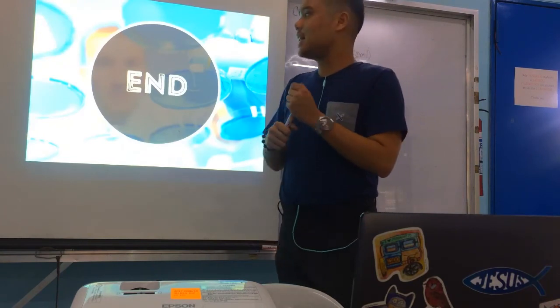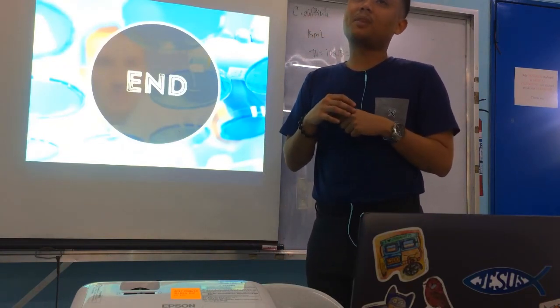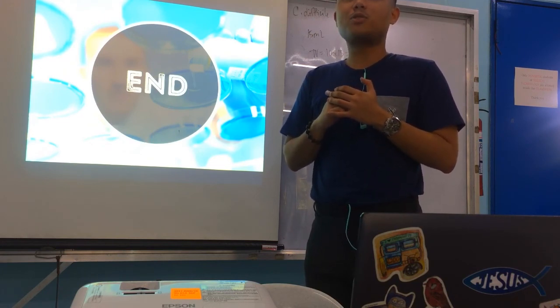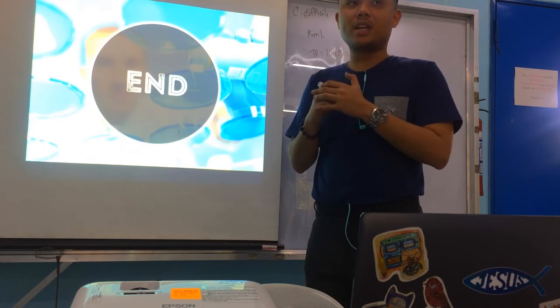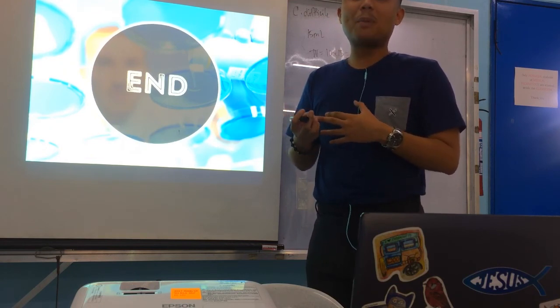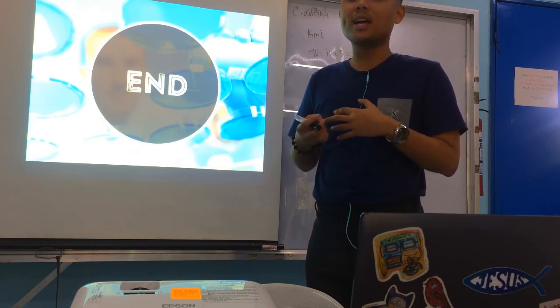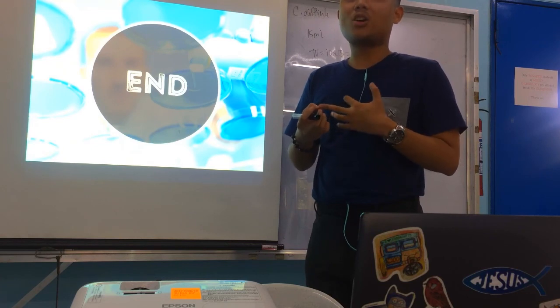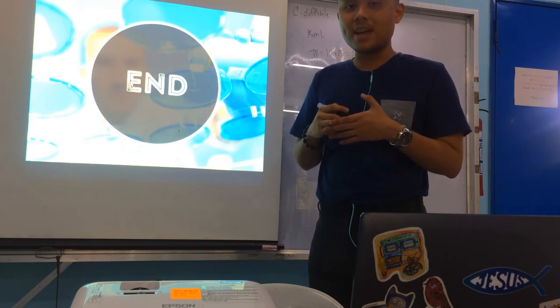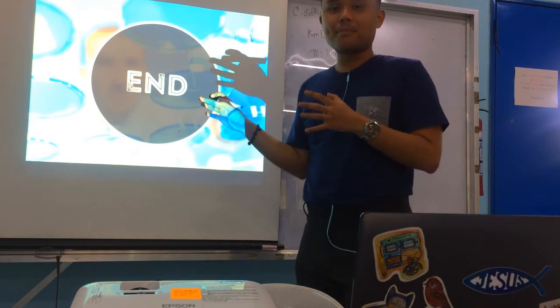Alright. So that's the end of our culture media preparation lecture. It's quite lengthy. I do hope it was a bit clear. So again, the media of choice for Chlamydia is McCoy cells. What needs to be cultured in the foot pads of armadillos is Mycobacterium leprae, the causative agent of leprosy and Hansen's disease. Bullseye colonies on CIN, Yersinia enterocolitica or Aeromonas. And greenish metallic sheen on EMB, you have E. coli. So again, that's it for culture media prep.